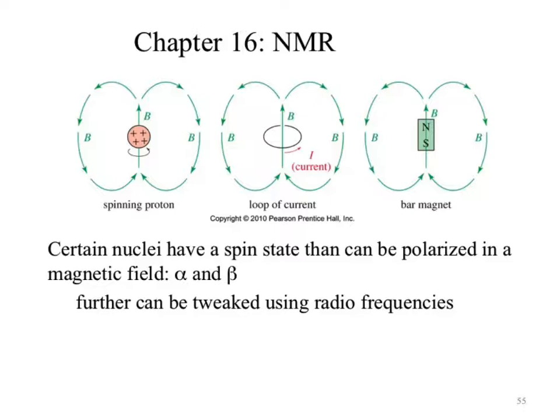A magnet. Okay? So what I'm doing in NMR is I'm now studying the nuclei of particular atoms. Okay? The nucleus must be magnetic, okay? Which brings in kind of an issue within this. Not all nuclei are magnetic. Hydrogen happens to be one that is immediately magnetic right out of the gate, which is awesome because hydrogen, H-1, has a massive abundance. So if I look at a sample, an organic compound, every single hydrogen in there is detectable by the instrument.